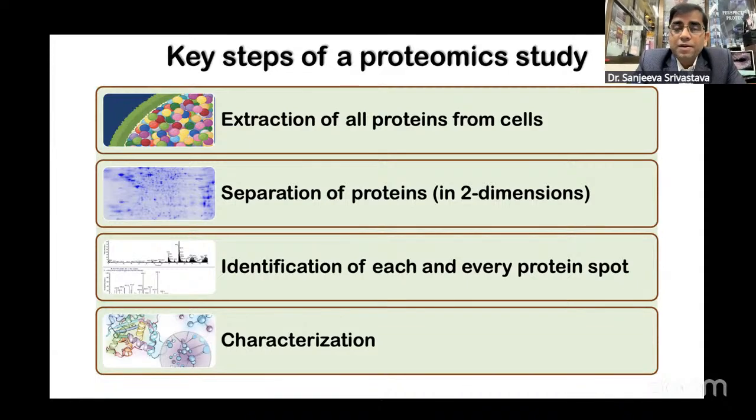And the only thing which will remain will be the protein, and that has to be also removed with the salt. So this is the first key consideration for looking at protein extraction at the proteome scale. Then you want to separate the proteins, and traditionally people have used two-dimensional gels, gel-based approaches, but one could also move directly without gels, with gel-free approaches with the mass spec, and again separate the complex proteome using different principles, which I'll talk about in more detail.